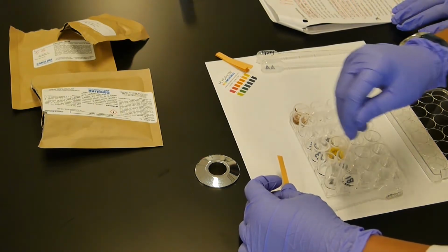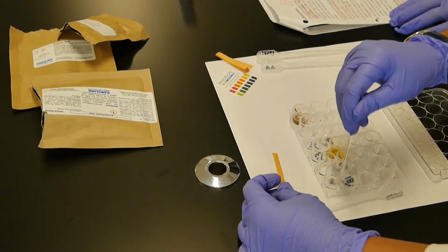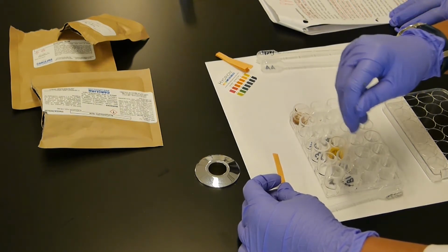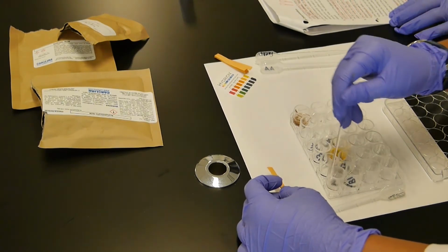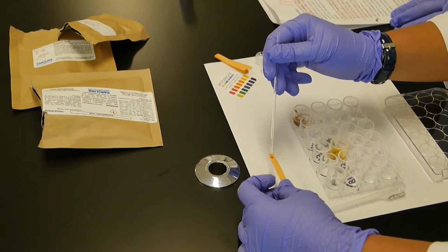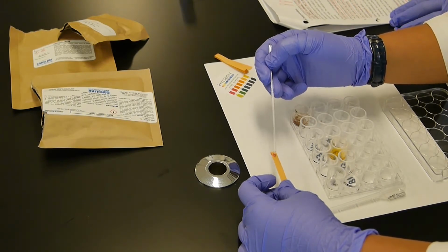Make sure to stir well the salicylic acid and the ethanol for them to react, and they need to mix well, and then use this end, put it on the pH paper to see the color change. So you will find your color change when you do your experiment.